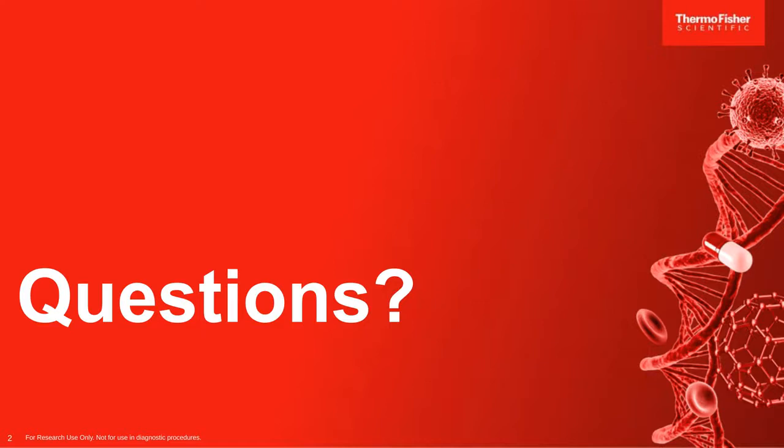Great, thank you. Next question, what type of cells can be analyzed on CytPix? Pretty much any type of cell that you would analyze in a conventional flow cytometer. So bacteria, yeast, mammalian cells, anything that you can collect your traditional scatter and fluorescence data from, you can also analyze on the system. Thank you. It looks like we have time for one more question. How easy is it to transition from a conventional analyzer to CytPix?